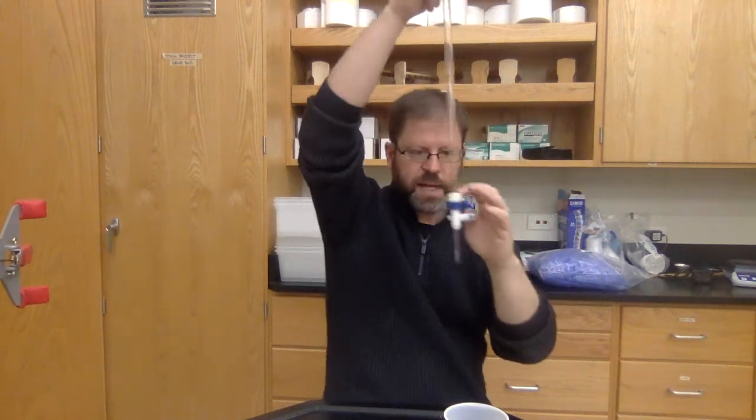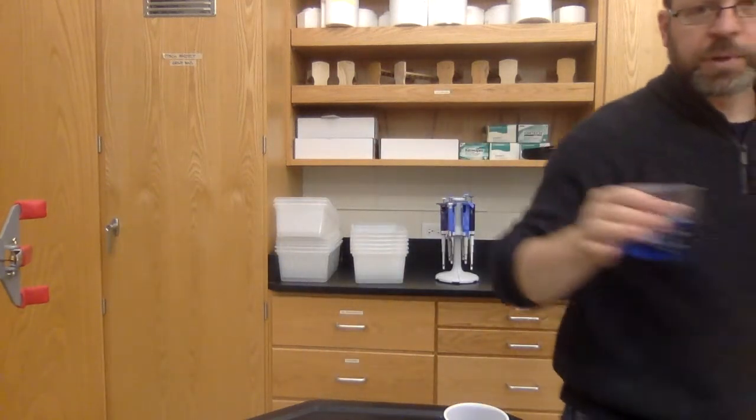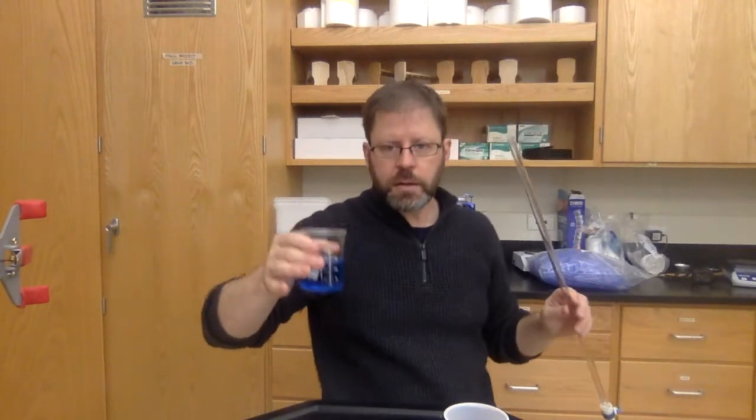Okay, so I have a tiny little plug of water right here, and if you think about it, that would dilute my titrant, so I don't want to do that. Okay, the blue, this is just food coloring inside of water. This is my simulated titrant. Okay, so the iodine stuff.